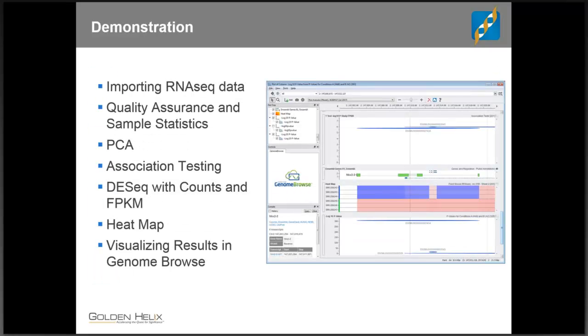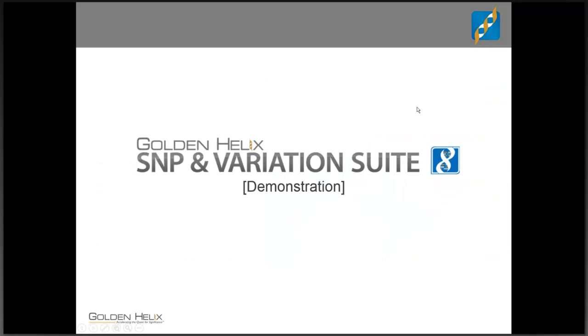For the demonstration today, I'll walk you through how to import RNA-Seq data in SVS. We'll do some simple sample statistics, perform a PCA, association testing, and then DE-seq analysis with counts and FPKMs. We'll also visualize heat maps and results in Genome Browse. So let's jump into SVS.